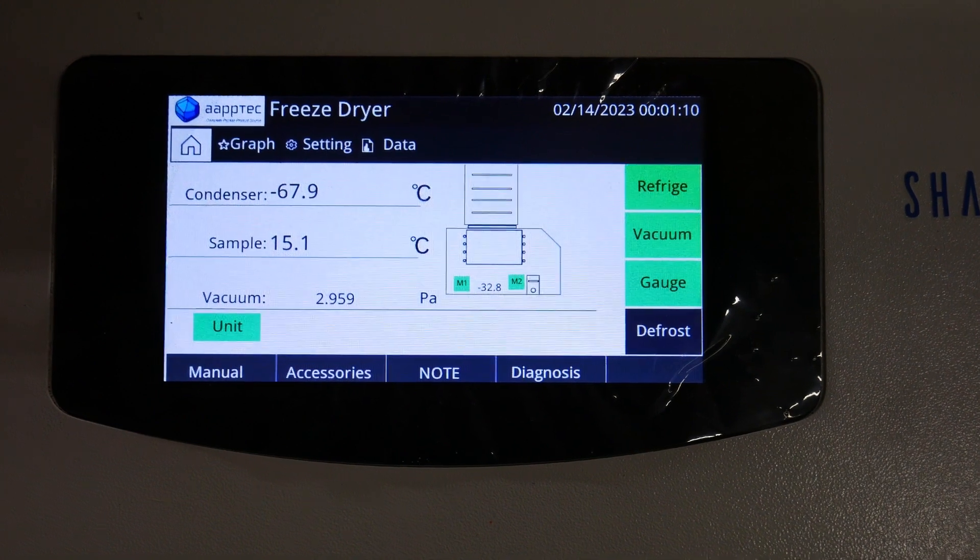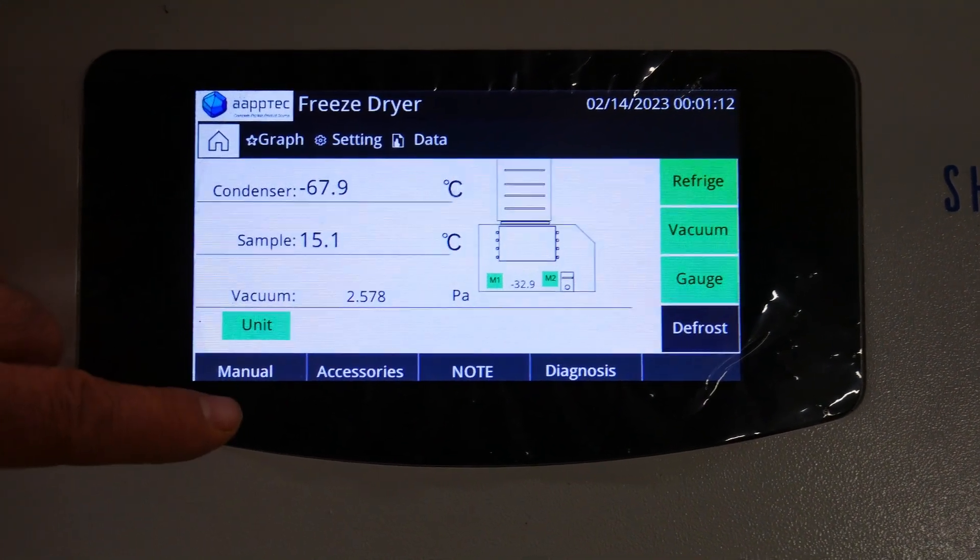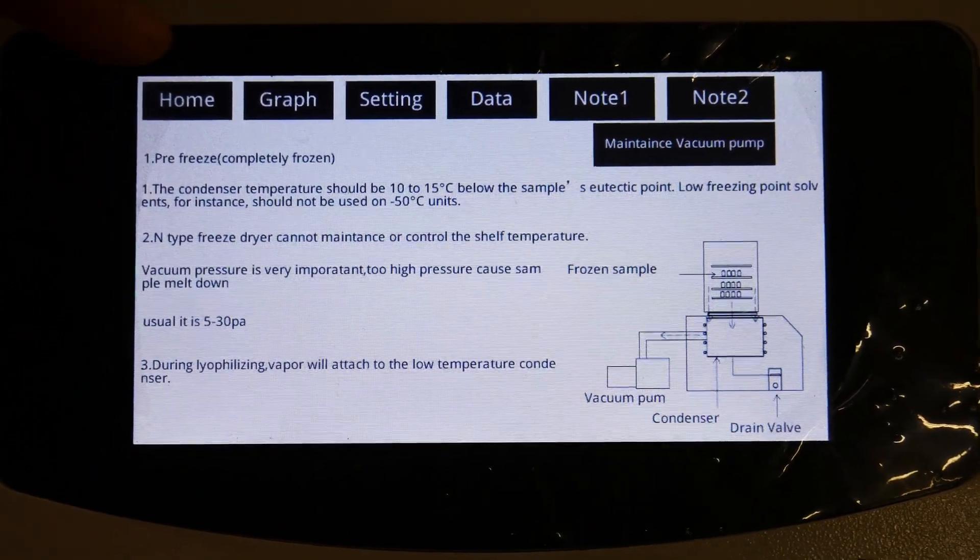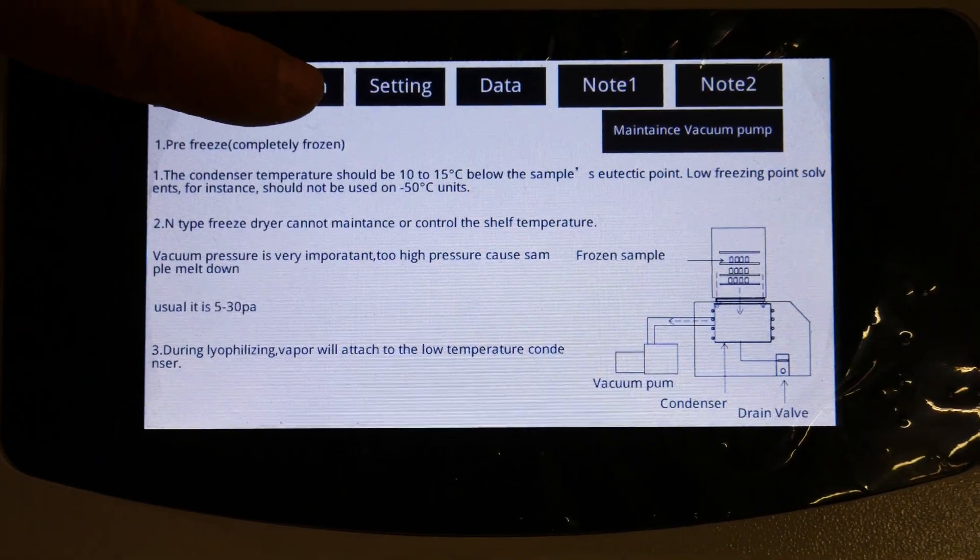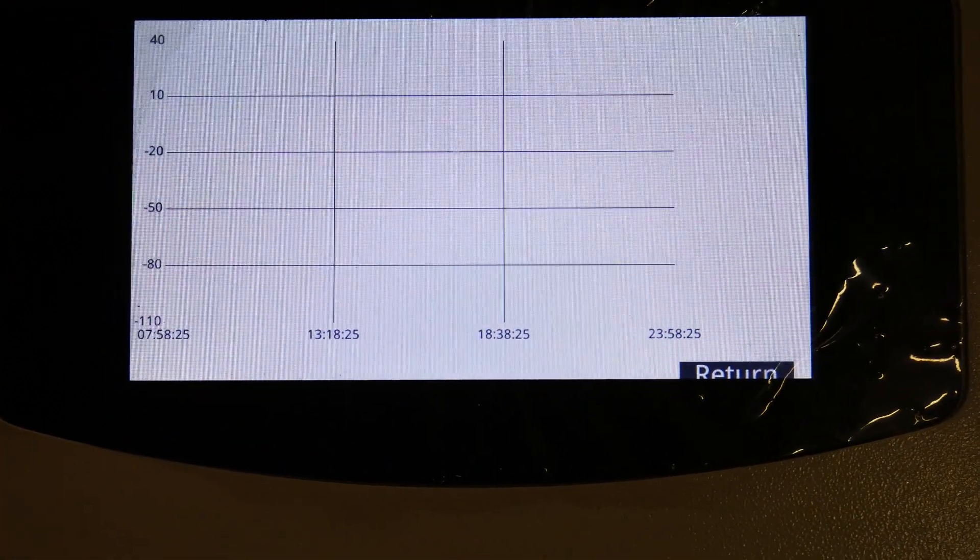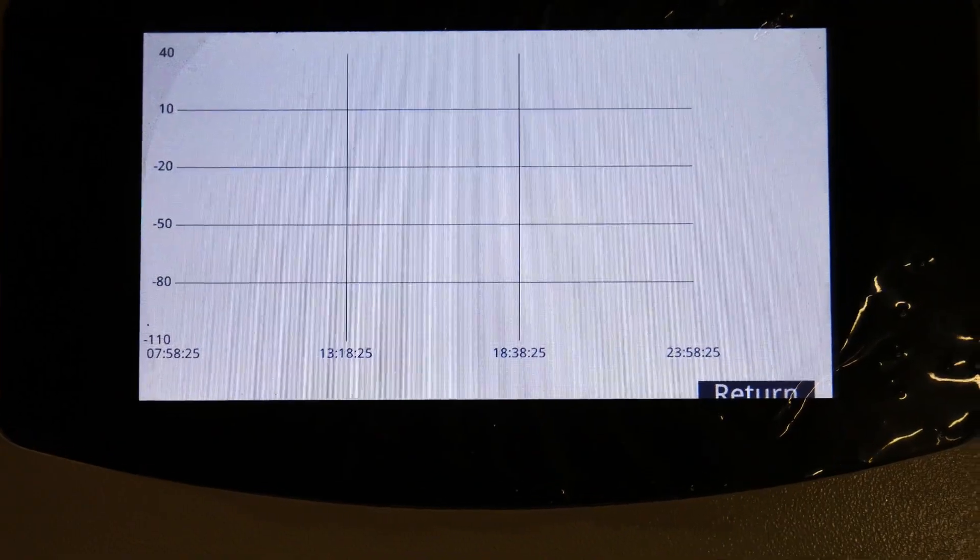You also have other advantages here. If you press here, the system guides you through operating it. For example, the graph shows you how it has been working the past three to four hours. Of course, in this case, it has not been running that long, so that information is not provided yet.